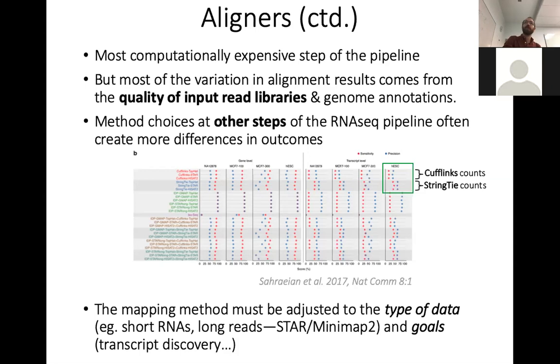I just have this paper. I guess that's fairly advanced. The only thing you want to know is, depending on your type of data, you might want to consider whether your process is the right one for the data.